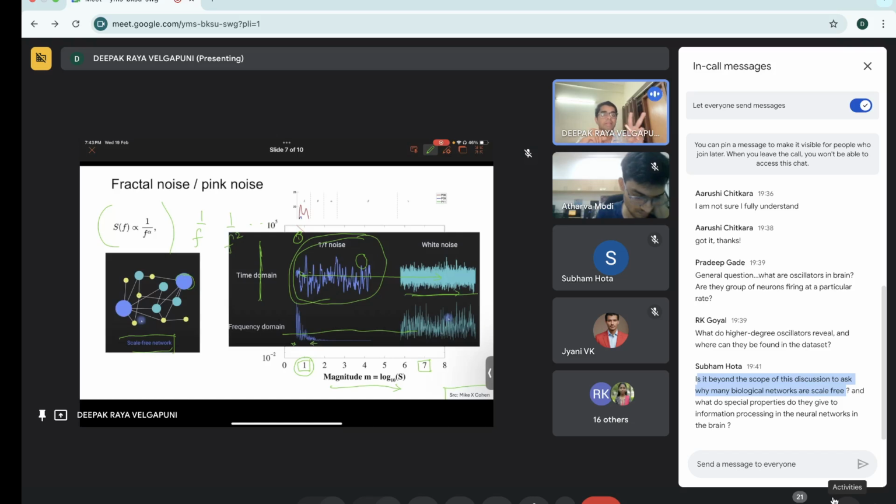So if you're analyzing in that case, 1/f noise becomes a feature, because it's saying something about the structure of the brain. Like I told, the number of oscillators, so the structure of the brain is changing, therefore the 1/f fall has changed if you take a longer time scale. So, is it clear, Shubham? Yeah, good.